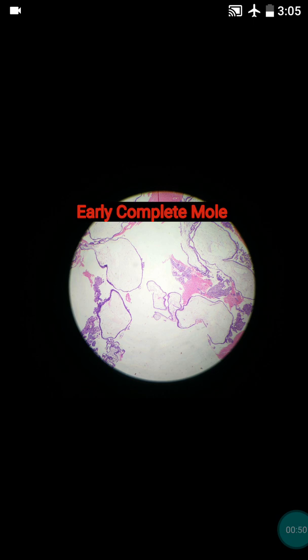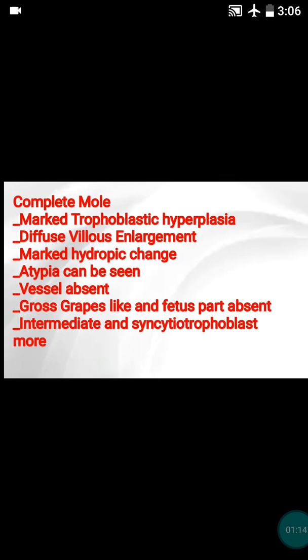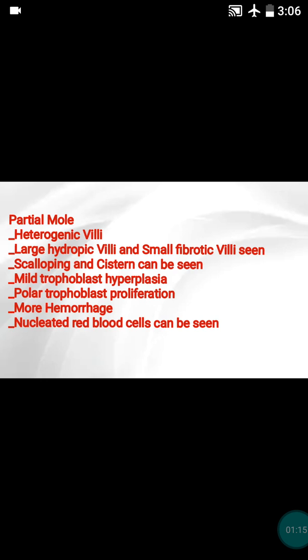Now, what happens in the hydatidiform mole? In the hydatidiform mole, you can see the hydropic villi — the villi will be hydropic and swollen, which is not normal as seen in products of conception. In this way you can differentiate the products of conception from the hydatidiform mole. This mole can be divided into two types: partial mole or complete mole.